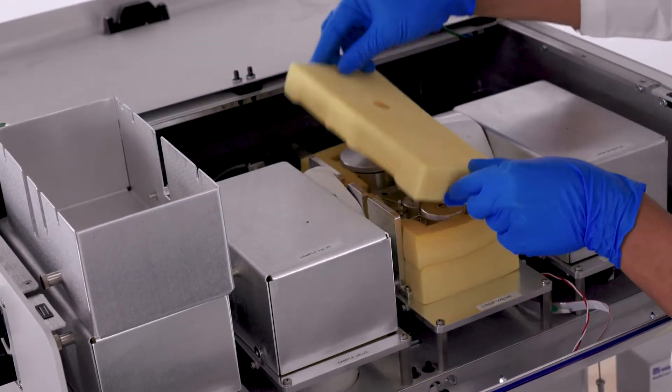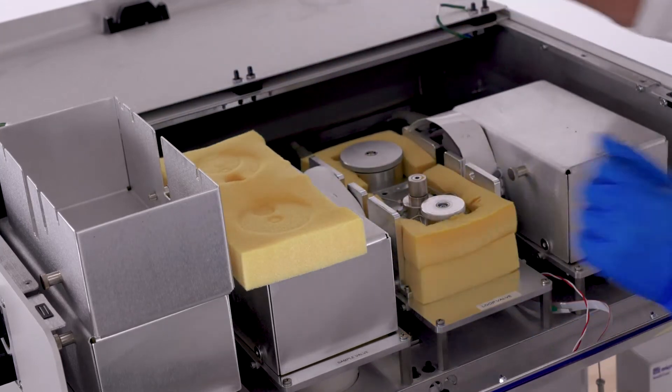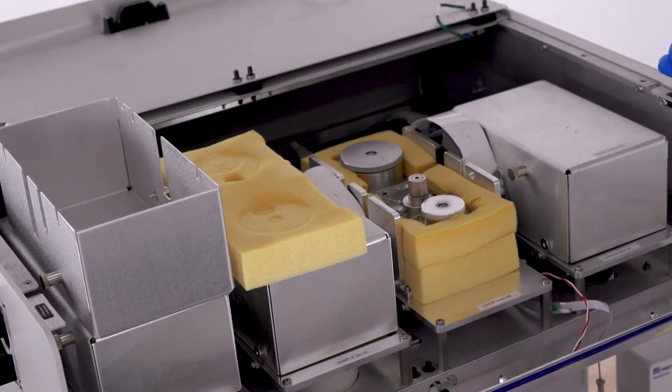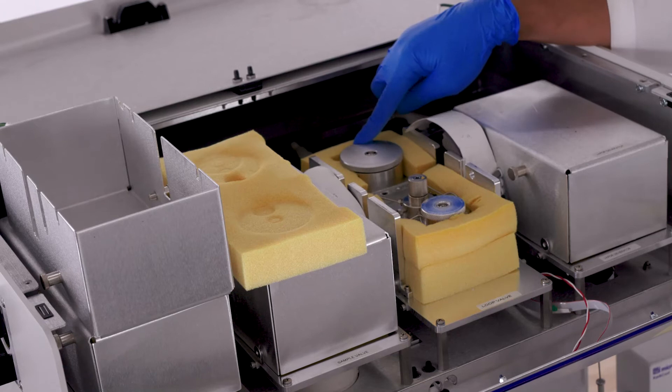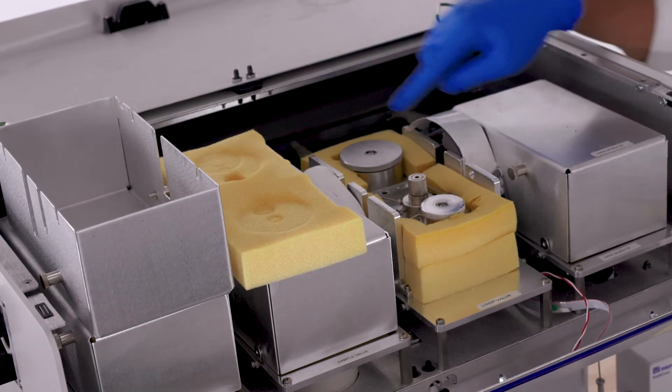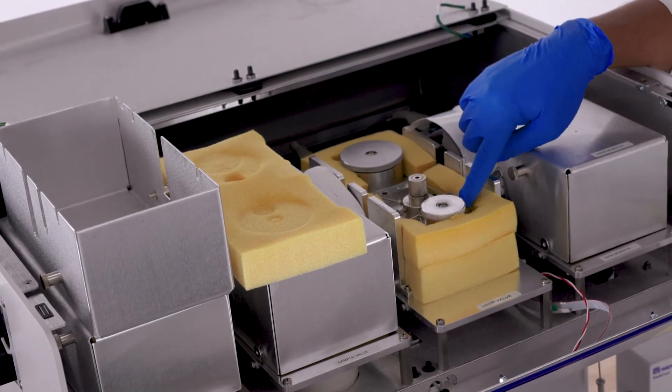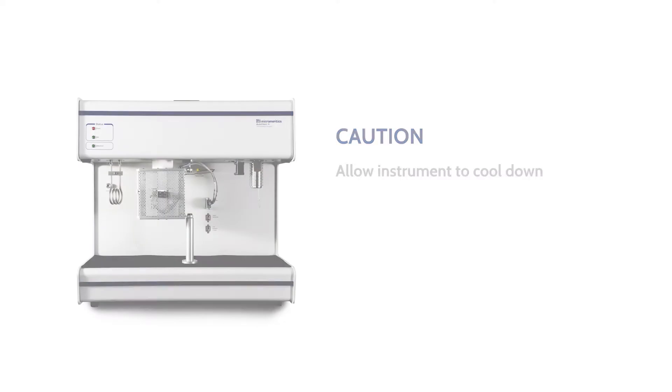Remove the top foam insulation and set it aside. There are two loop enclosures on the AutoChem 2. The enclosure to the rear of the instrument will hold the 5 cc loop, while the enclosure to the front of the instrument will hold either a 0.5 cc loop or a 1 cc loop.